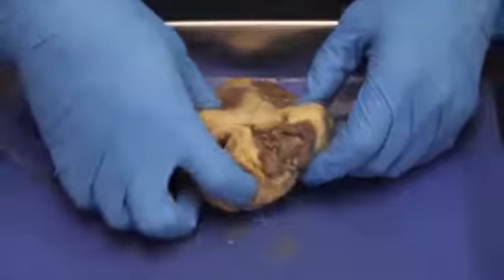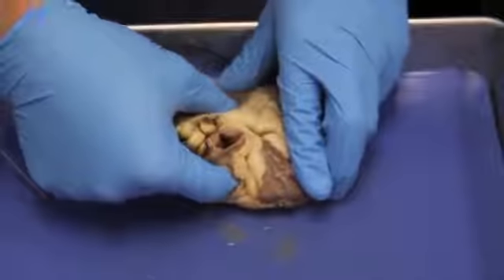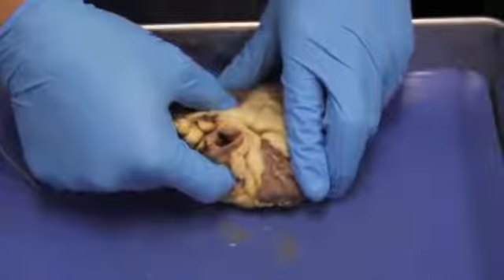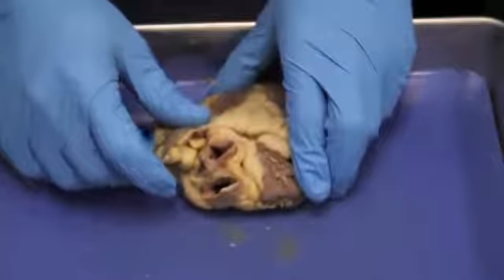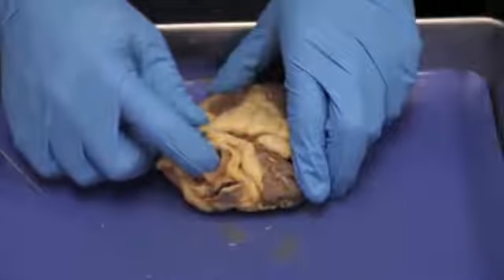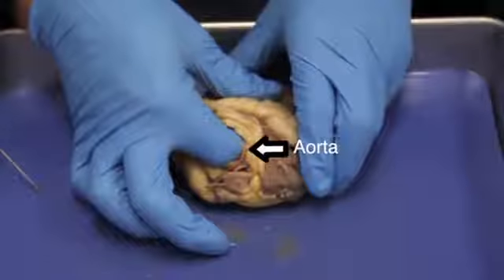Here's a pulmonary artery. And as I poke my finger down into the pulmonary artery, I notice that I'm going deep into the heart. That means I'm going into a ventricle. The same thing with the large vessel next to it, which is the aorta. And as I poke my finger into it, I'm going deep into the heart.